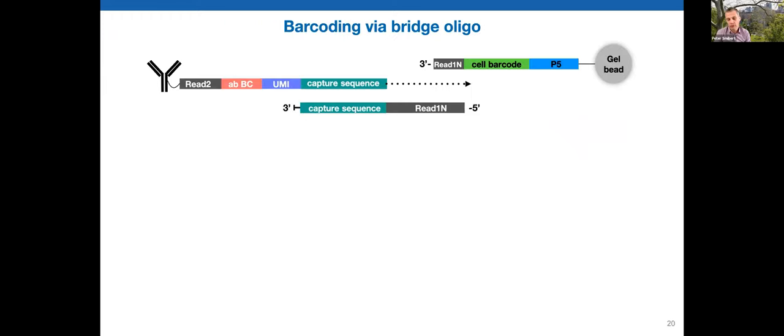The other thing that was kind of stopping us to some extent was, as I mentioned, BioLegend has taken the ball and run with this and made thousands of different catalog items. It's a real pain to conjugate oligos to antibodies, especially if you're not really hardcore biochemists, like we are not. So we were motivated to find a way of doing this that didn't involve making a whole new set of conjugates. Fortunately, the way that ATAC-seq works, there's a linear amplification step within the droplets where, in 10x at least, there's 12 cycles of linear amplification.